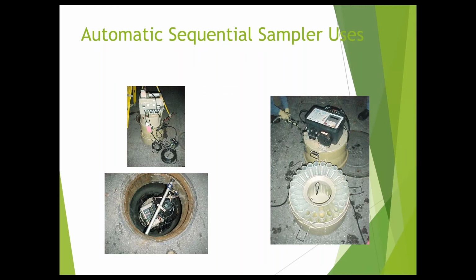If you look at the picture on the right, you'll see that there are 4 or 5 containers that are darker than the rest. They have fluid in them. When those were analyzed, we could see that they were discharging things that they should not have been. In other words, they were in violation of their permit. Well, if we had a huge composite sampler and all of this was blended in with their normal daily sample, you wouldn't be able to identify this because dilution would have been their solution.